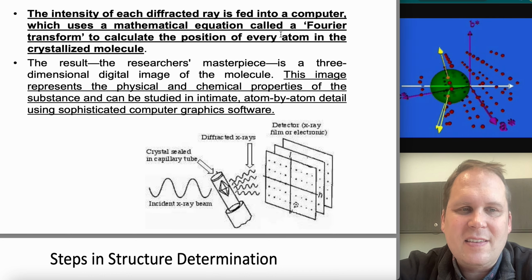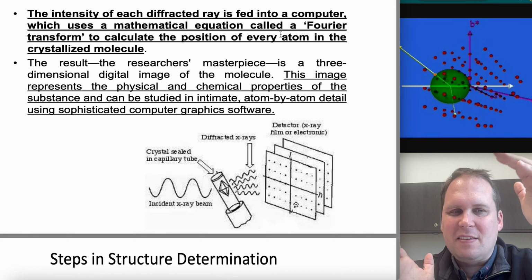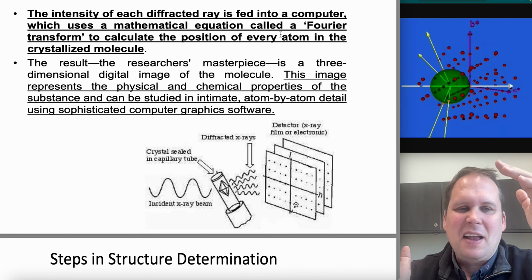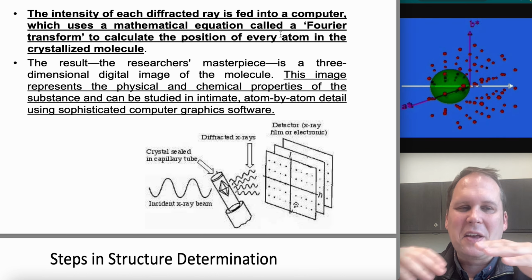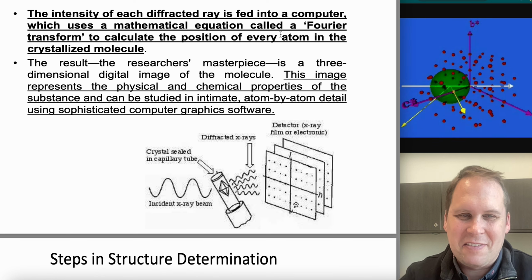And then those are some of the statistics that let you say, all right, we have resolution out to this much data, and it's 98% complete there. But if we were to go one step further, it would be 5% complete. It's just like a cliff.